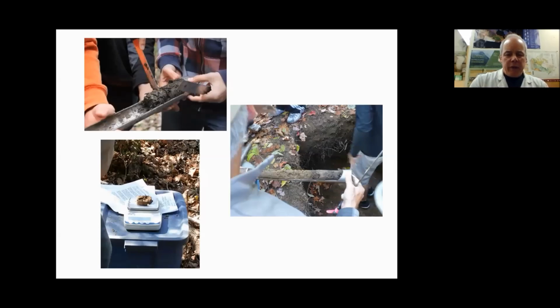So in the diagram I showed you before, we had a cube of soil. Quite frequently in the field, we use a soil auger, which can be cylindrical, to determine bulk density of the soil. Again, I'm going to demonstrate this in a minute, but I'll just show you one example here on this slide where we've taken a soil core with an open-sided soil auger. We can determine the volume of the auger, knowing the dimensions, its radius and the height of the core that we're going to sample. And then you can see weighing it out on the balance below to calculate the bulk density.